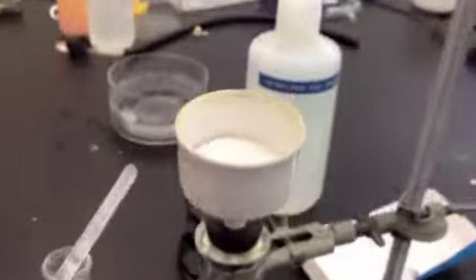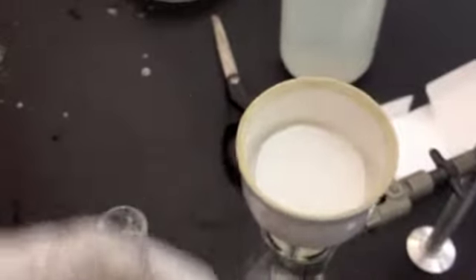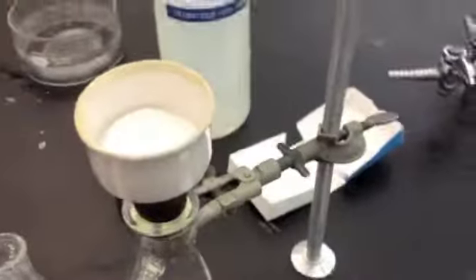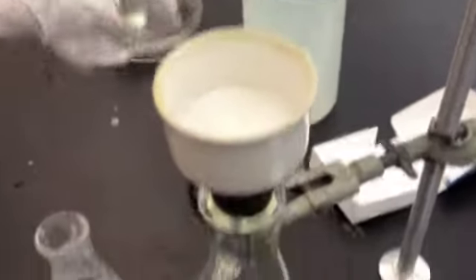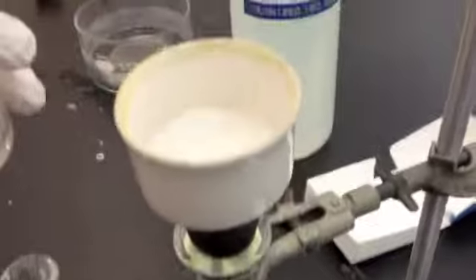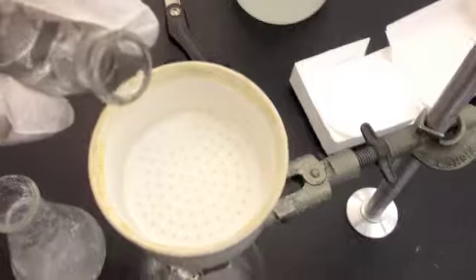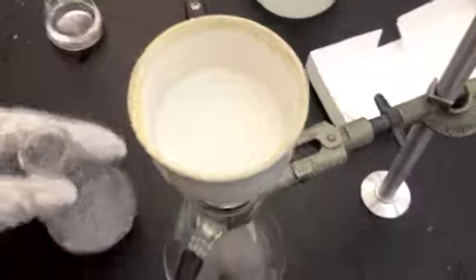Now remember that we need to wet the filter paper. Since we did it a little while ago, it's dry again. So let's wet the filter paper. Make sure, by the way, that you have the water on so that the vacuum will actually be working. So pour some of the solvent. Make sure it's cold onto the filter paper. You don't want it to be hot or room temperature because then it might dissolve your product. So now that we've wet the filter paper, we can pour our recrystallized product onto the filter paper.